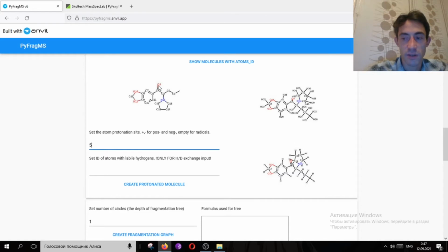Remember the previous video in which I was talking about protomers. Protomers are gas phase isomers which differ only by site of protonation. And during electrospray ionization, such protomers can be formed, and in the collision cell we have absolutely no way to separate protomers.